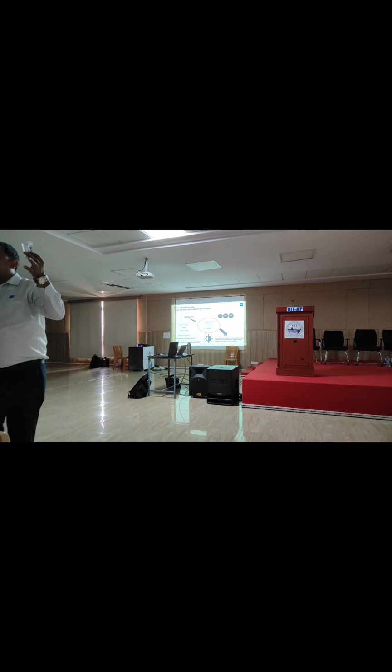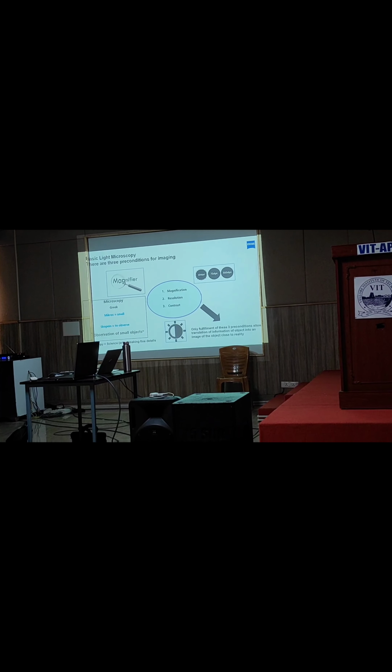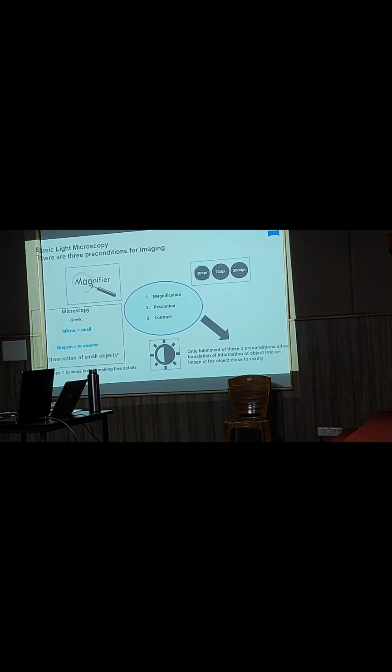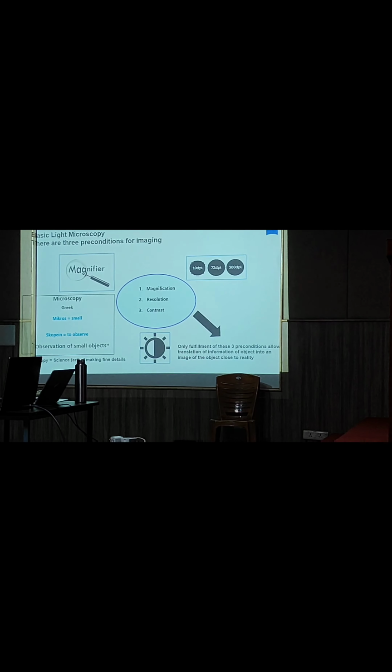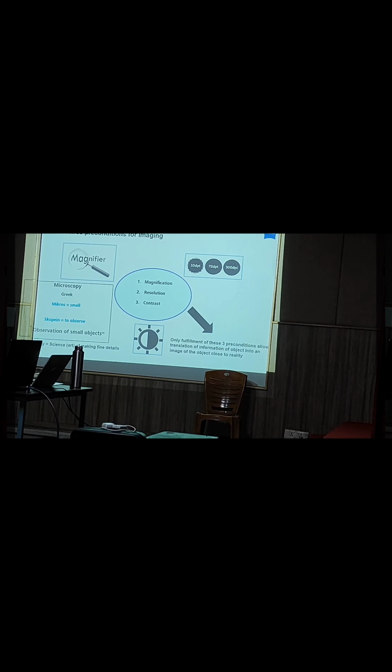Taking examples from the biological sciences, I have this tissue section, and without putting any stain, I want to see it properly, right? So I need to modulate the amount of light which is falling onto it.